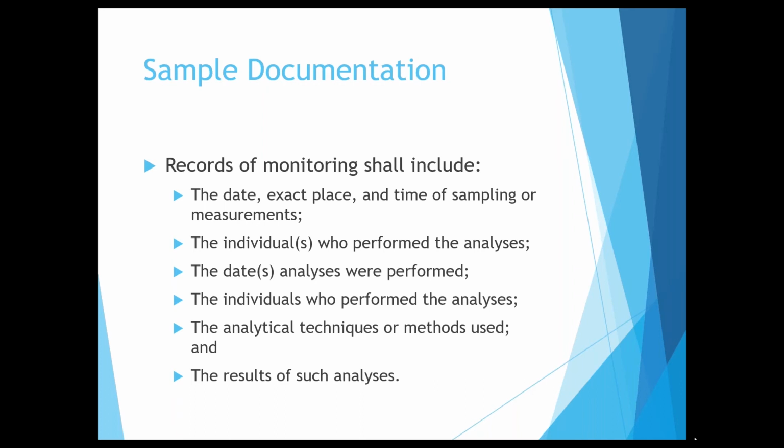So let's see. It depends on what you're sampling. You can always transfer the sample. So let's say you had a large bucket. If the bucket is clean, you can collect your sample in the bucket and pour it into your smaller containers. This is acceptable with the exception, and again, these are for samples, not measurements, of DO, pH, all of those. pH, you can do that with.